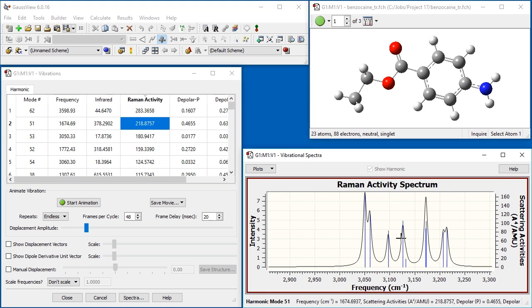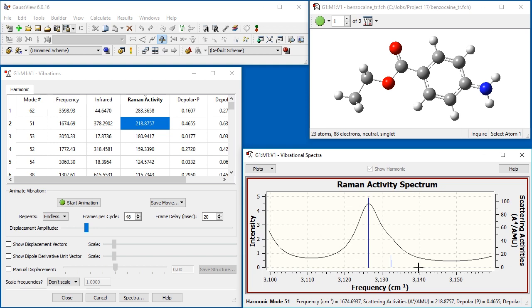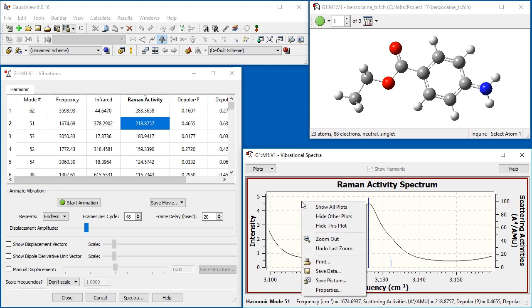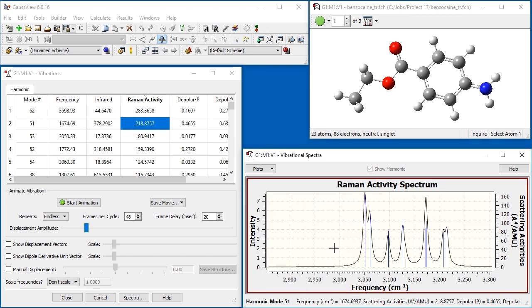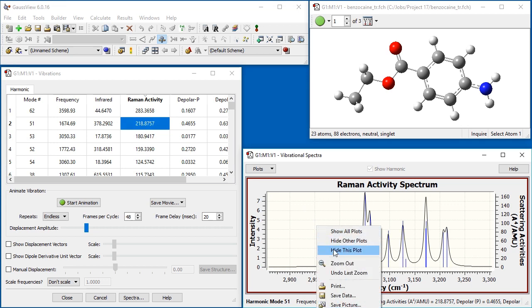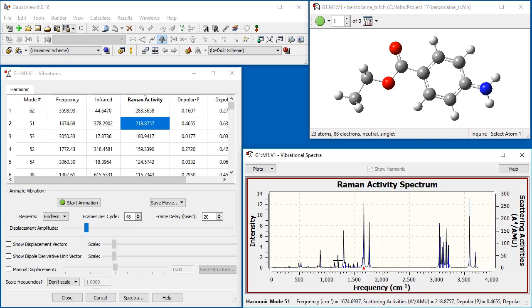In order to zoom out, there are two choices available in the context menu. The undo last zoom item reverses the most recent zoom in, while the zoom out item restores the display as it was before you started zooming.